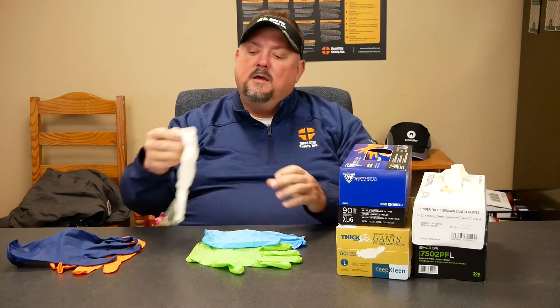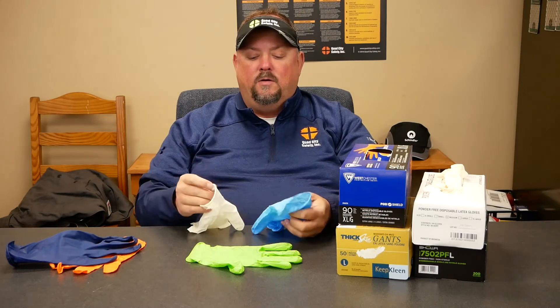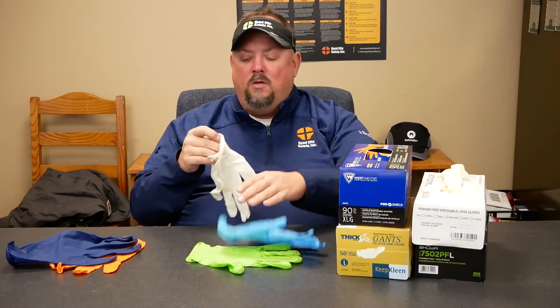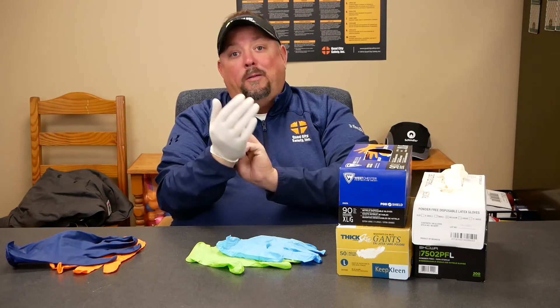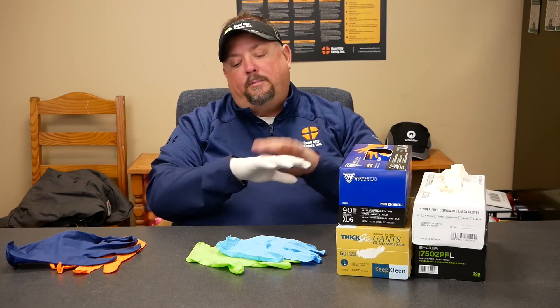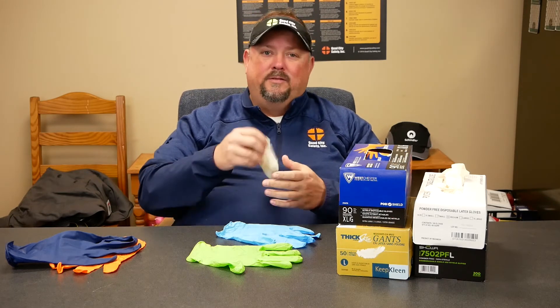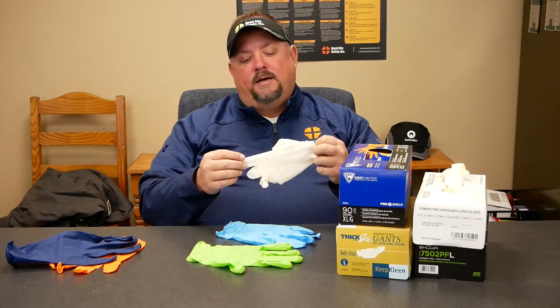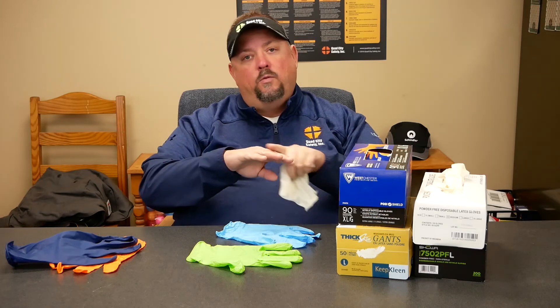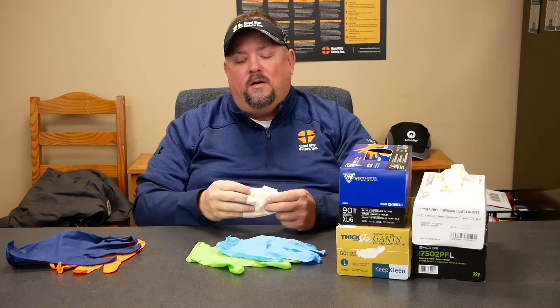Also out there is latex. Latex is a bit of a bummer in that from a price standpoint it'll be a little less than nitrile, and it has a tight fit because it's basically rubber — very tight-fitting. But the problem is certain oils will break it down. The biggest downside on latex is that 13 to 20 percent of people have an allergy to the protein, and putting those people into latex gloves will cause them to break out in a rash.